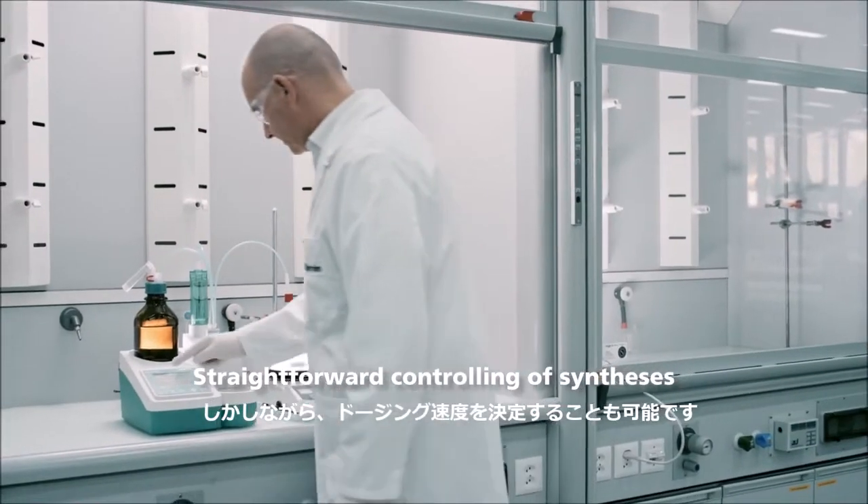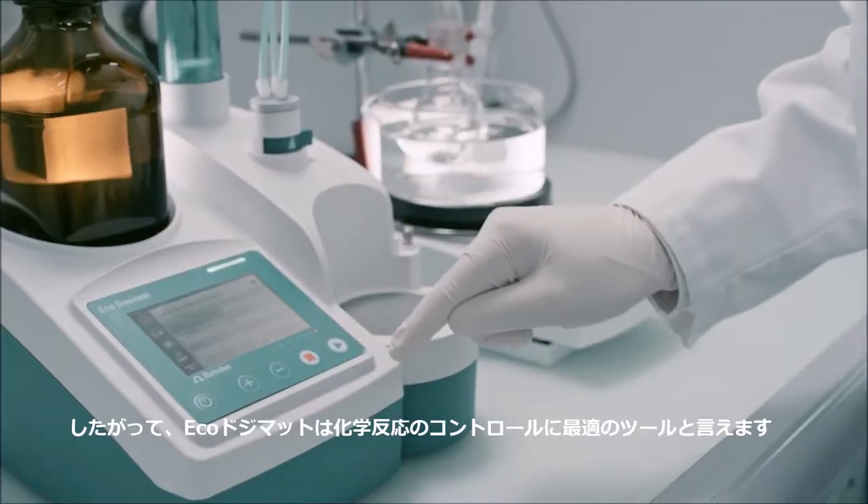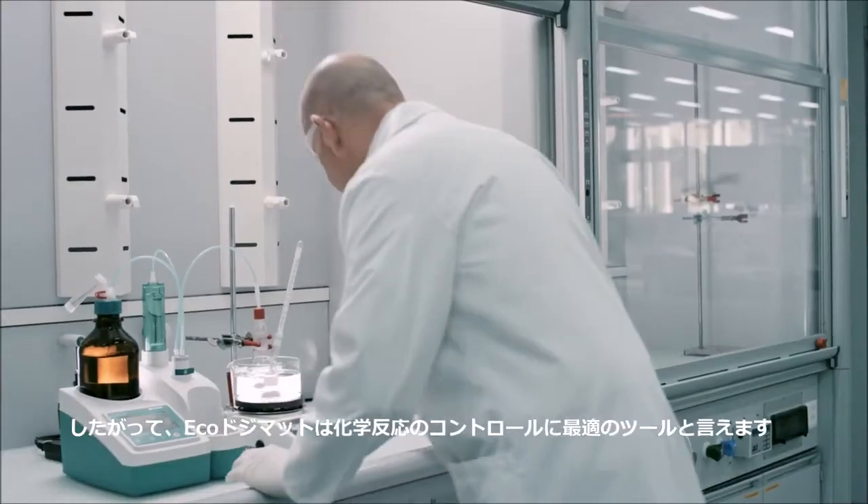However, you can also define the dosing rate, which makes the EcoDosomat the perfect tool to control chemical reactions.